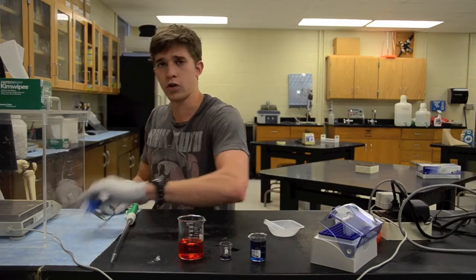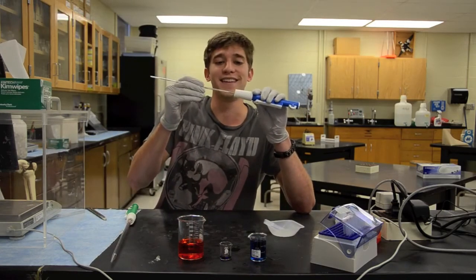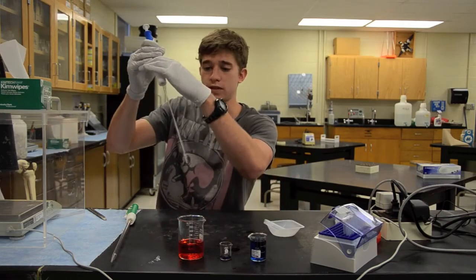The small pipette works in the exact same way. You want to put the right side in. Just click it in like that. And you're going to roll it up and squeeze this to take the liquid out.